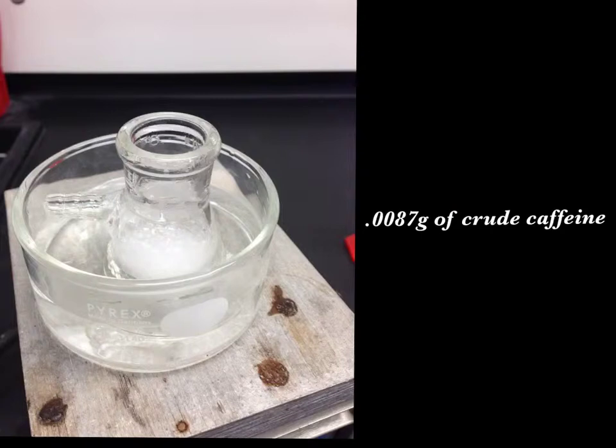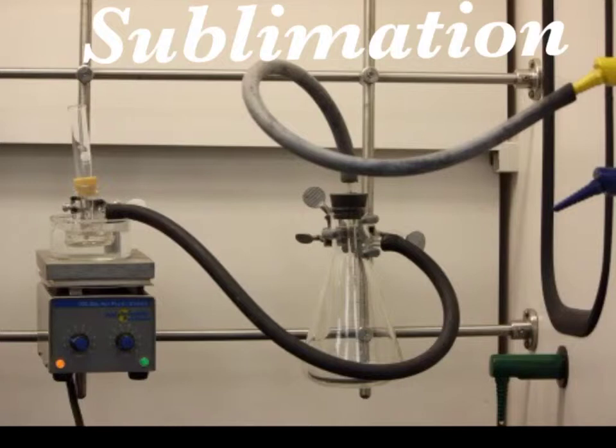Once the caffeine was extracted from the aqueous layer by the dichloromethane, the dichloromethane was vaporized, leaving behind 0.0087 grams of crude caffeine from 1.61 grams of tea leaves. A sublimation technique was used to purify the crude sample. The technique utilized high heat and low pressure to sublime the caffeine.